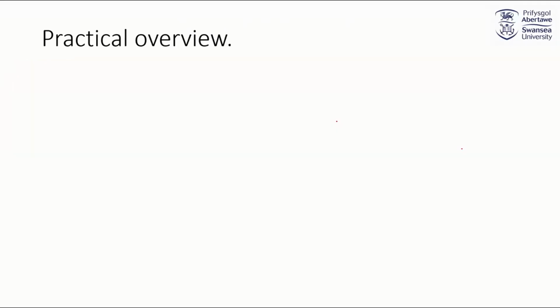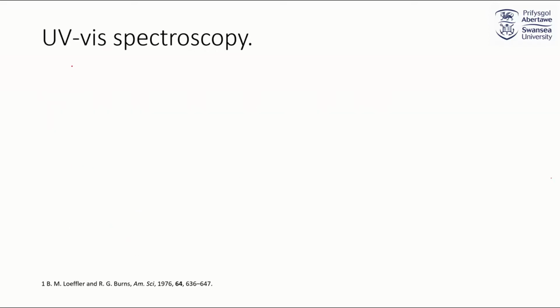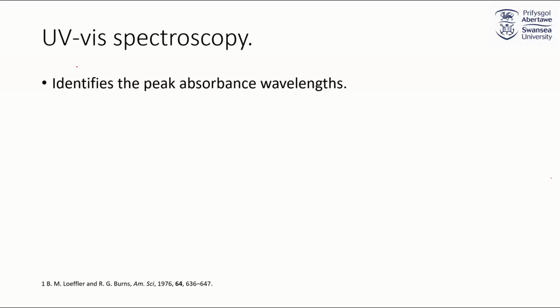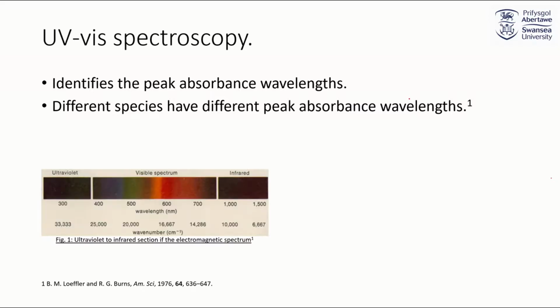The practical investigations of vanadium color complexes will consist of some redox reactions, one where vanadium is reduced and one where vanadium is oxidized, some ligand exchange, and importantly spectroscopy will be used throughout. UV-vis spectroscopy is a very useful analytical tool as peak absorbance wavelengths can be identified, and a different colored species will have its own peak absorbance wavelength.